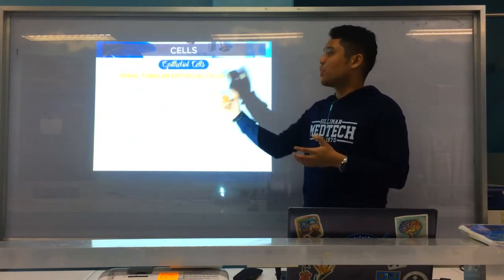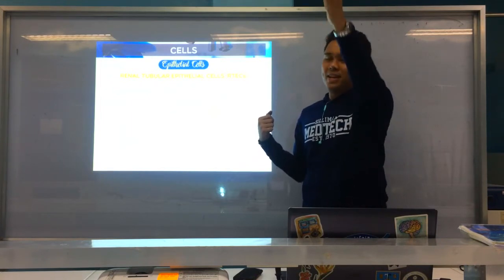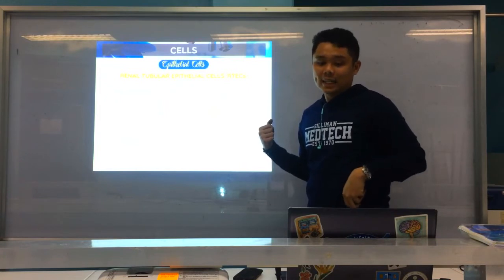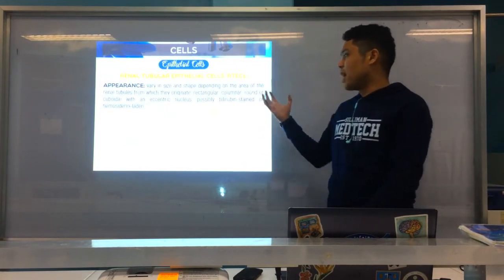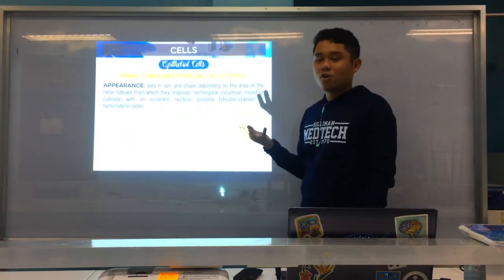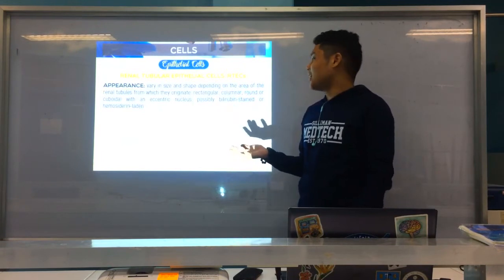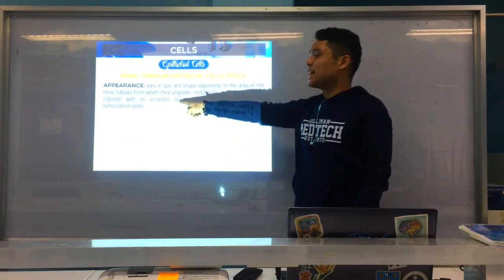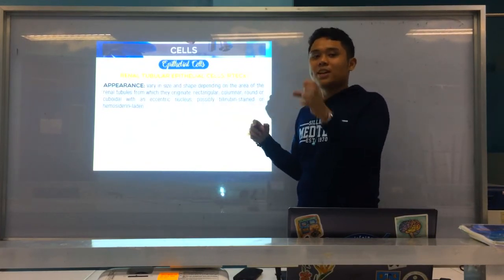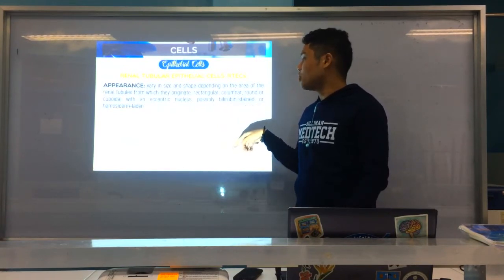Why? Because again, by the name itself, renal tubular. So gikan siya sa tubules mismo sa imong ihi. Ihi sa imong kidneys mismo. So gikan sa PCT ba, sa DCT, or sa collecting duct. Okay? Now, it appears, it varies in size. Usually, again, kung asa sila na tubules gikan. Each tubules has their own type of shape. And eccentric again ang nucleus, meaning wala siya na center. Off-center siya. And then possibly bilirubin stained or hemosiderin laden.